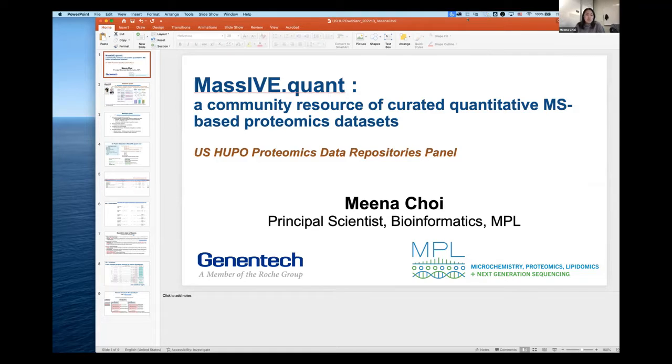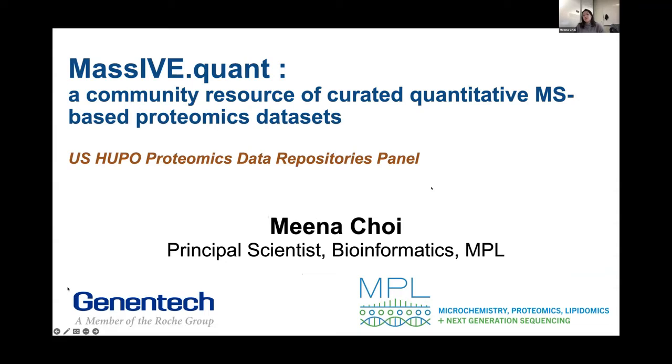Today, I will talk about MassIVE-Quant, which Nuno introduced. Luckily, I had a chance to work with Nuno and Yaset very closely a few years ago, and I want to share what we have done so far. My presentation is more focused on the user side. Yaset, Nuno's group and other big groups work on the whole data repository, but I'm focused on the user side, on how I can benefit from this large data set.